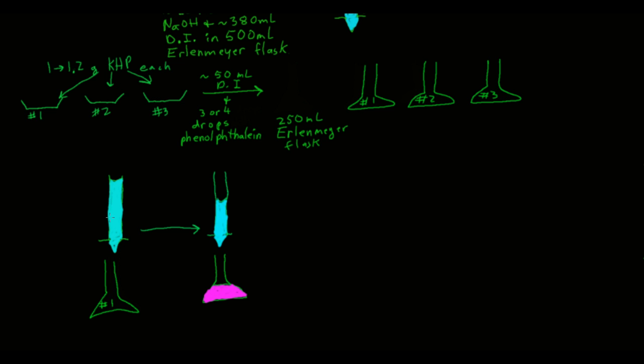The technique is: add the sodium hydroxide solution and swirl the flask — add and swirl, add and swirl. When you start to see flashes of pink appear and then disappear, slow down and go drop by drop. Add a drop, swirl; soon you'll see flashes of pink that disappear on swirling. When the flashes start to last longer, you know you're almost at the end point.